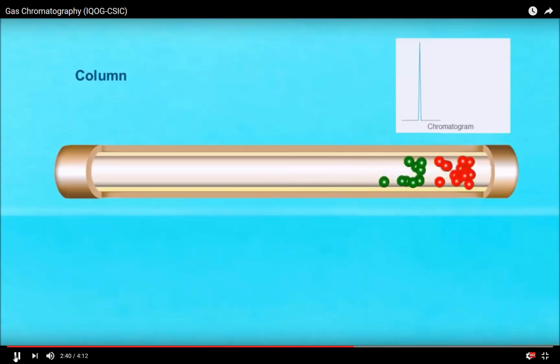So the blue one comes out first, the red, and then the green. The longer the column, the better separation you will get.